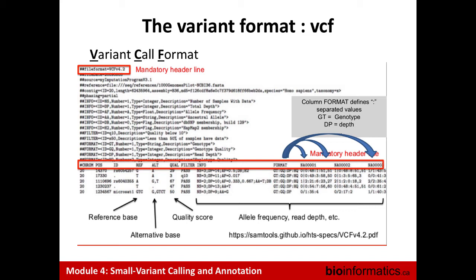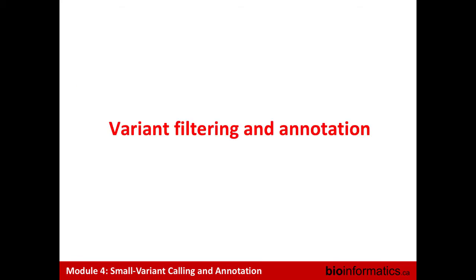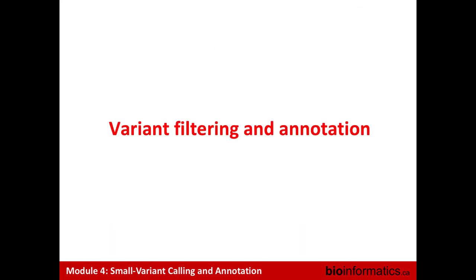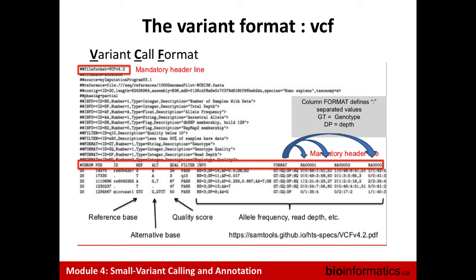We have a genotype which is called 1/2. Because when you have a comma in the alternate field, which separates the different alternate alleles, it will be allele 0, allele 1, allele 2, and so on if you have more than one. So here, when we see 1/2, it's a GT genotype.